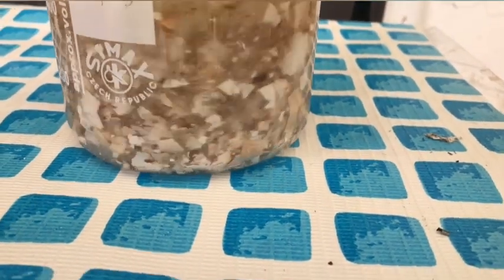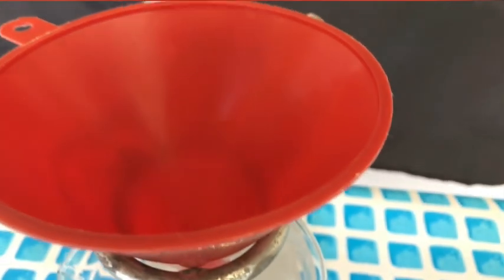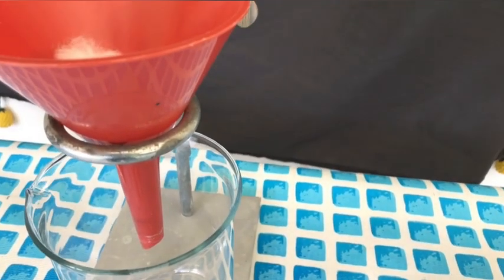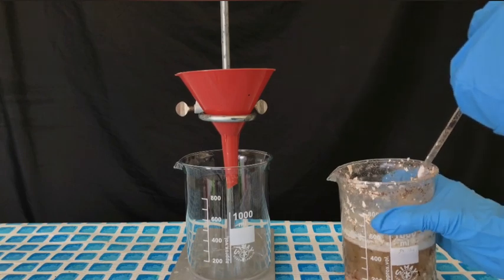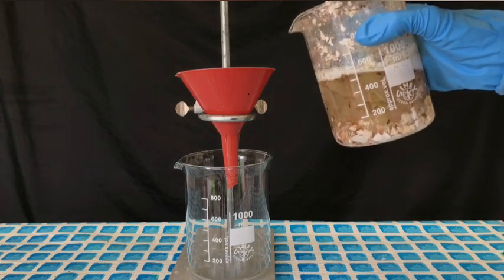Four days later it looked like nothing was happening anymore. For this reason, a simple gravity filtration setup was set up and all of this stuff was poured into the filter. The goal here is to get rid of all of the organic gunk contained in our acetic acid and calcium acetate solution.